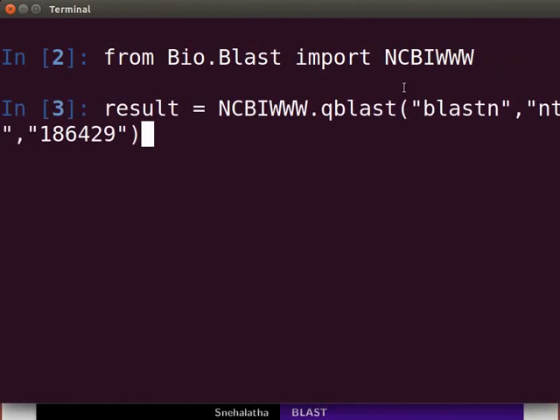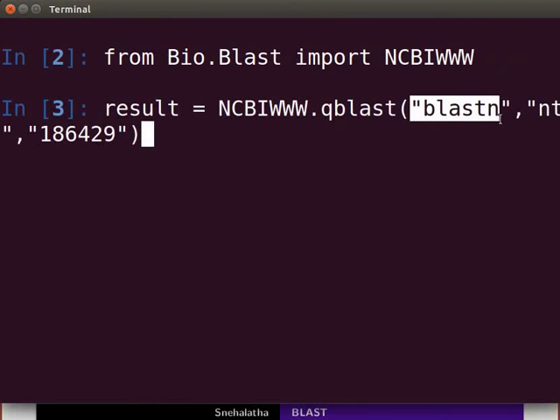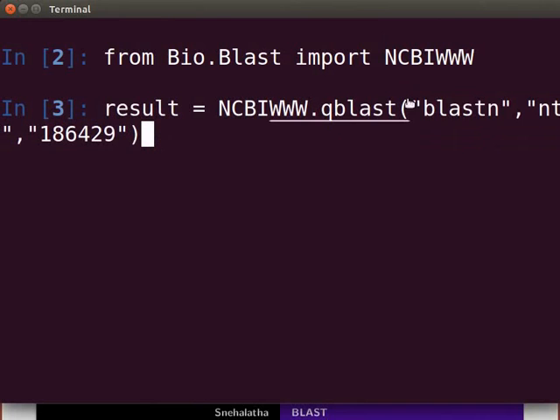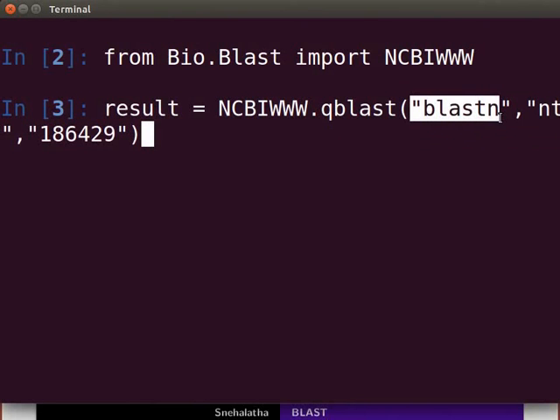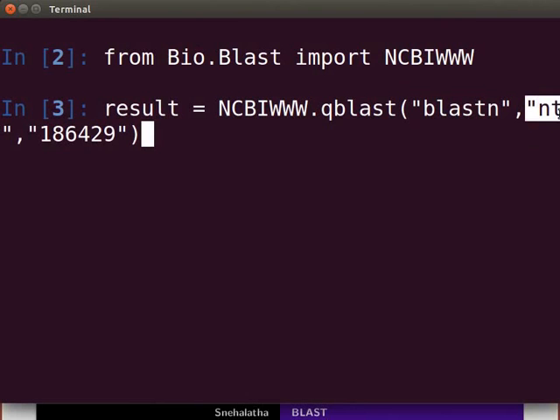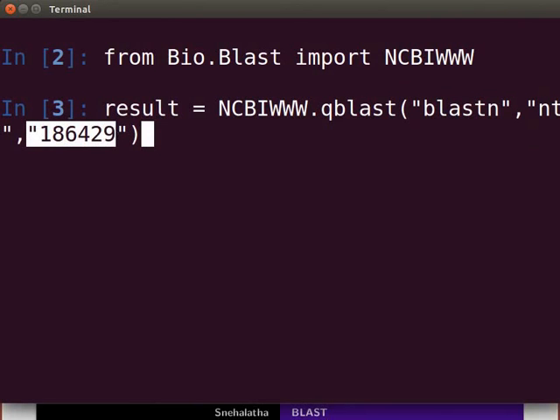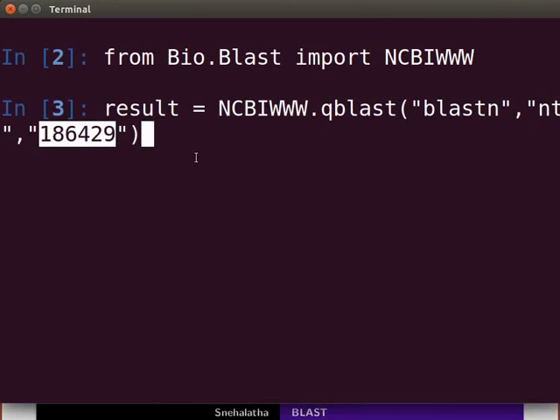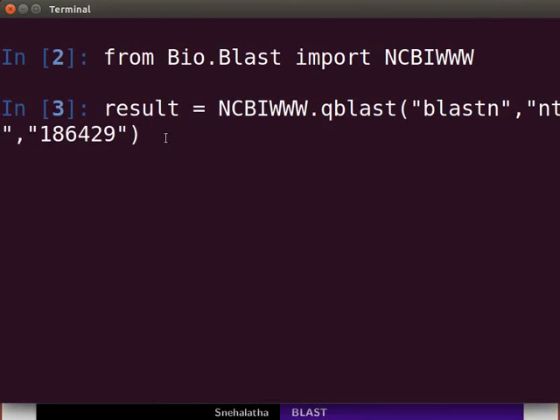We will use the QBLAST function in the NCBI WWW module. The QBLAST function takes three arguments. The first argument is the BLAST program to use for the search. Second, it specifies the database to search against. The third argument is your query sequence. The input for the query sequence can be in the form of a GI number, a FASTA file, or a sequence record object.